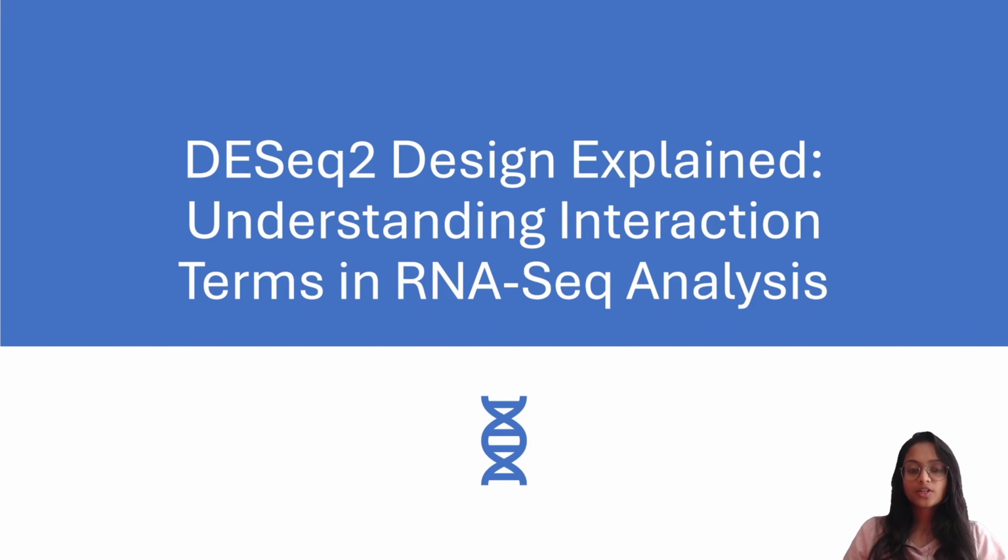One of the key strengths of DESeq2 is its ability to handle complex experimental designs, which often involve multiple factors that may interact with each other. So in this video, we'll break down the concept of interaction terms in DESeq2, understand how to include them in our analysis, and demonstrate how to interpret the results. By the end of this video, we will have a solid grasp on how to leverage the interaction terms to enhance our RNA sequencing analysis.